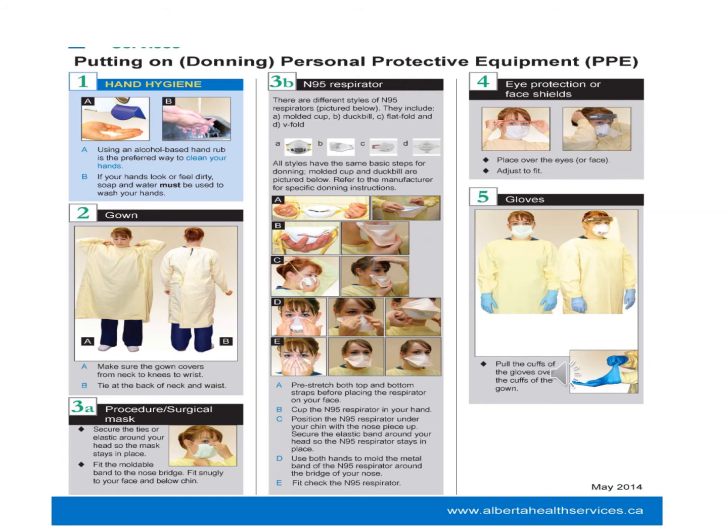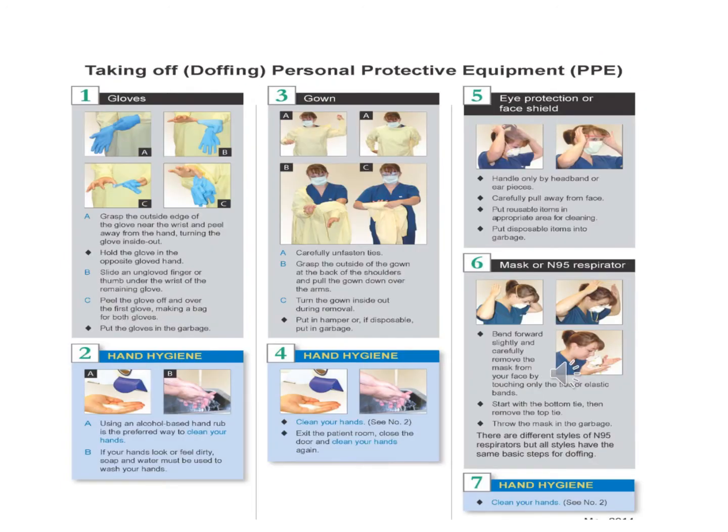So these are all the donning steps, and even if somebody else is working and you are supporting, all these steps should be followed. And once the cleaning is done and the spillage is removed, then the taking off, or doffing, of personal protective equipment has to be done. Again, these are the sequence of steps that should be followed.